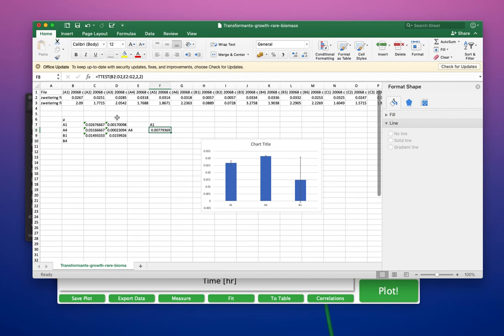I'm a bit confused about this, but anyway. I hope that's helpful, and that means you've got a nice fit and you don't have to try fitting lines and work out by eye what's the best way of doing it. You can just use the growth rate model and also make lots of nice bar charts as well.